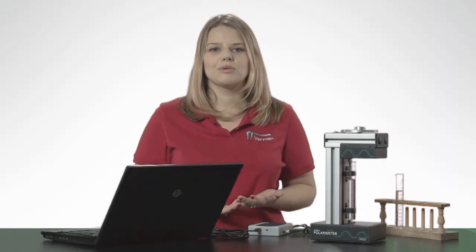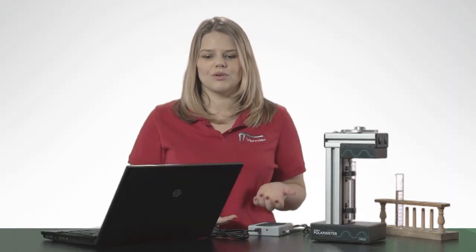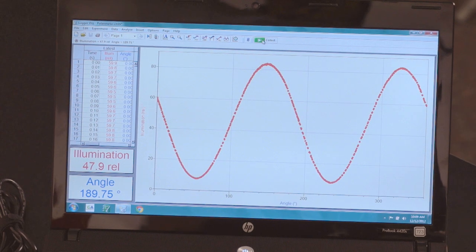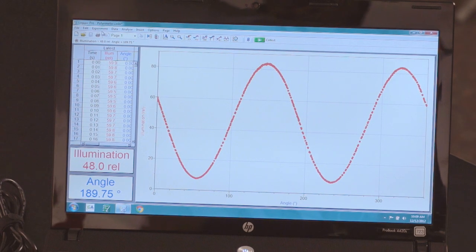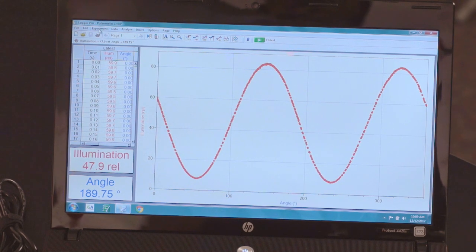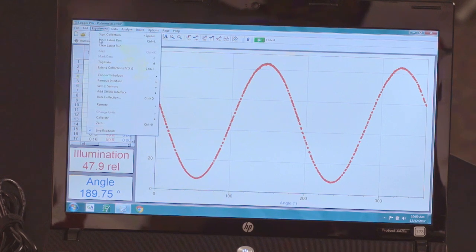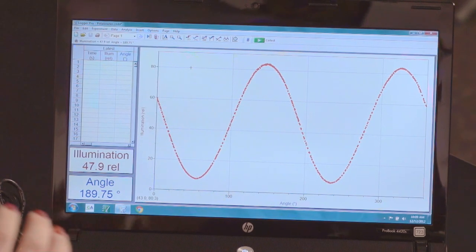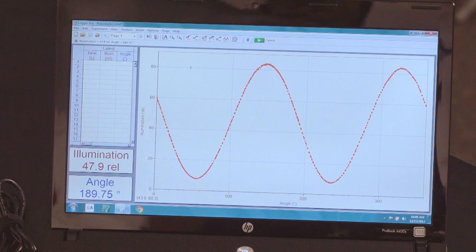Data collection will continue for 15 seconds, so I can stop it early if I like. Once data collection is stopped, I need to make sure and store that run so I can compare my optically active sample to the water.